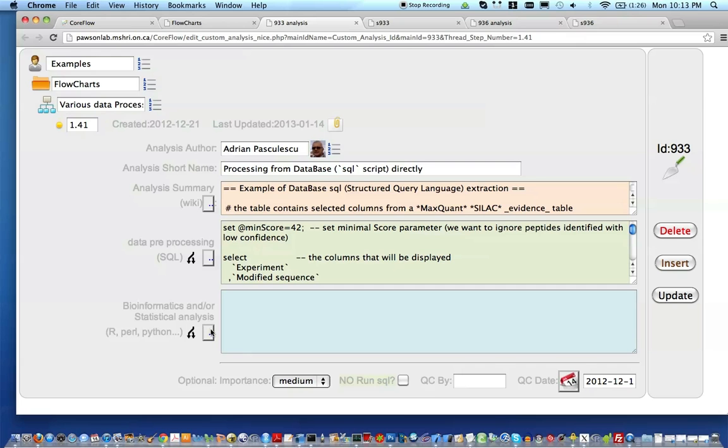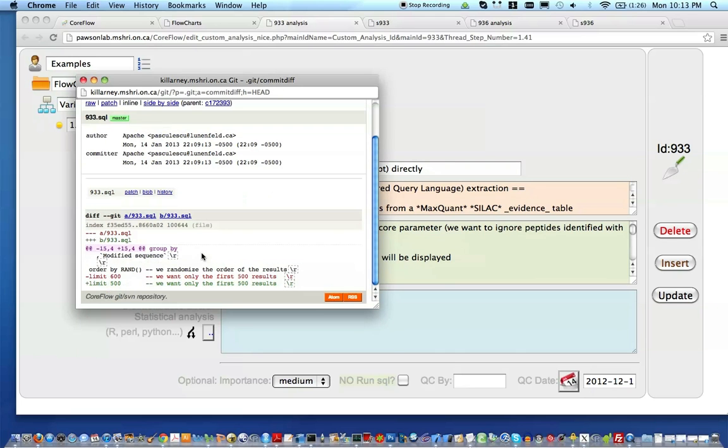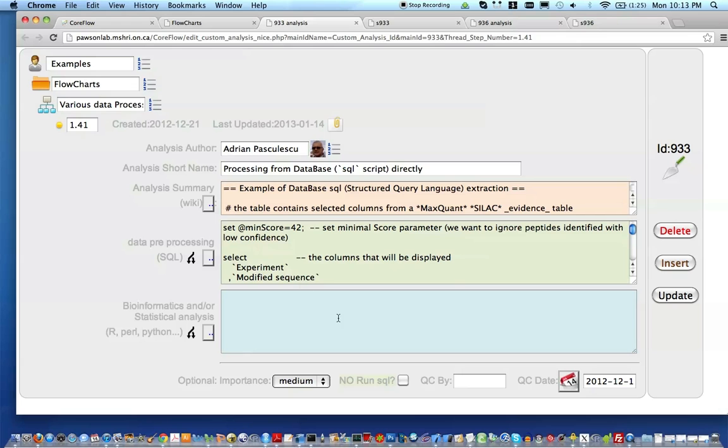You have seen also that you can save, for example, this particular script in a versioning system. Here you can see the differences between previous and current versions easily. The same thing can be said about the other field. The fourth field is the bluish one.